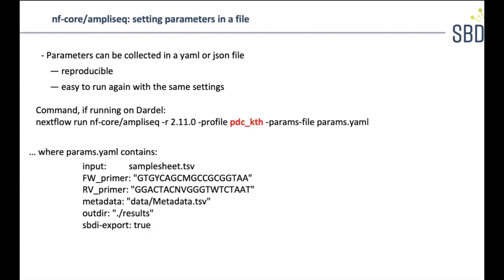Well, if you want to run on Dardel, there is this new profile, pdc_kth, which makes the run smooth on Dardel. So there are a number of these predefined profiles that you can use for running on different compute infrastructures.